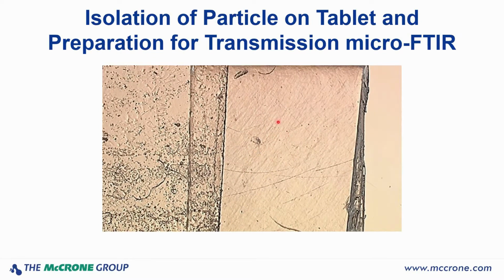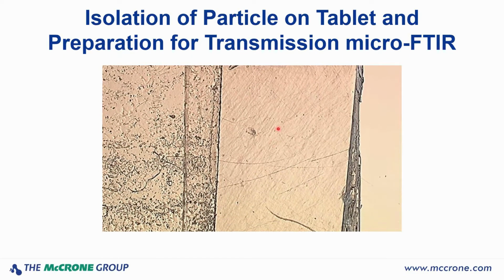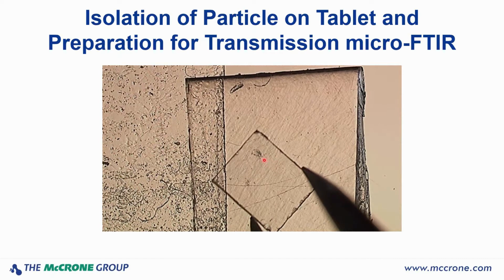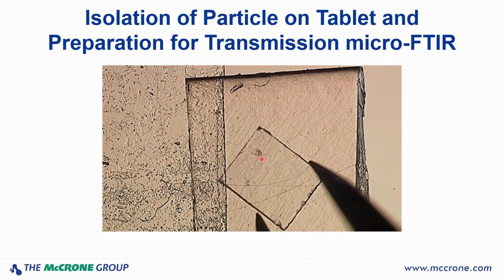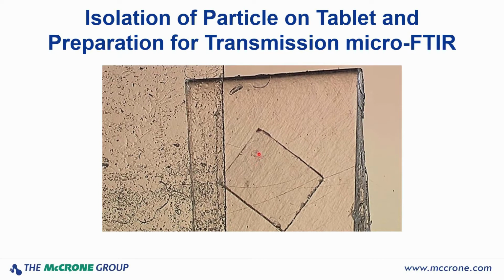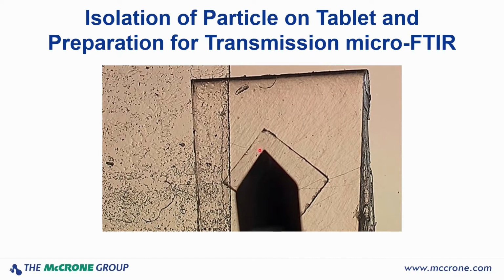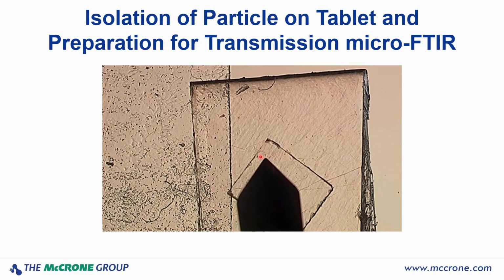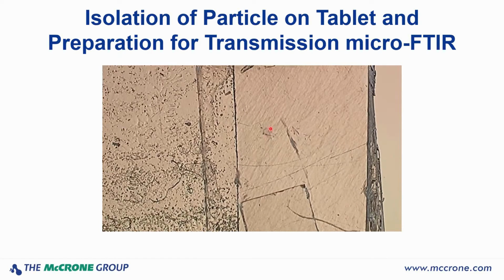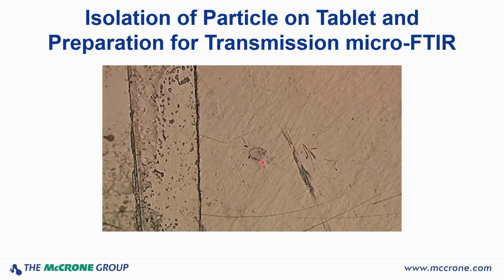These surface scratches and this stuff makes no difference to what we're doing. It's not contamination. Now we're going to take one of our small cover slips and lay it on top of that. We're going to now take the tungsten carbide scribe, because it's got a tip on it that will grab a hold of that microscope slide, that glass, so that we can press down and pull that glass down, so that some samples will smear, other samples we just want to embed so the sample doesn't blow away.